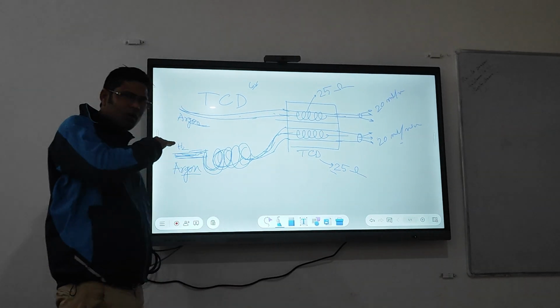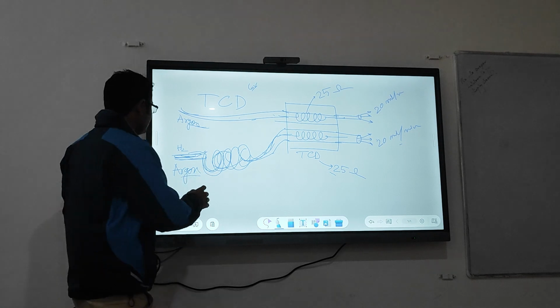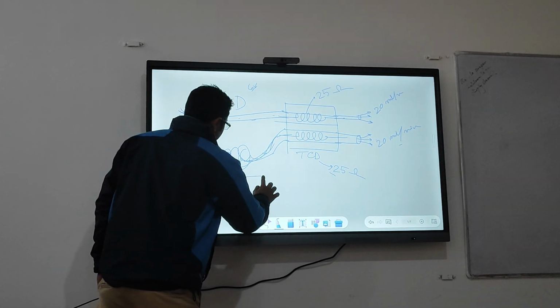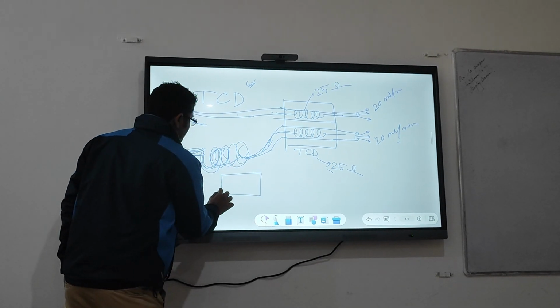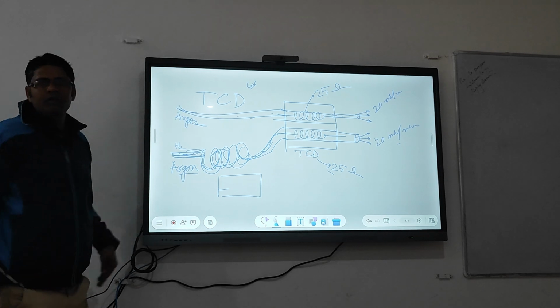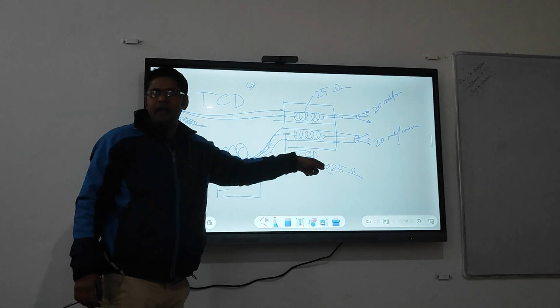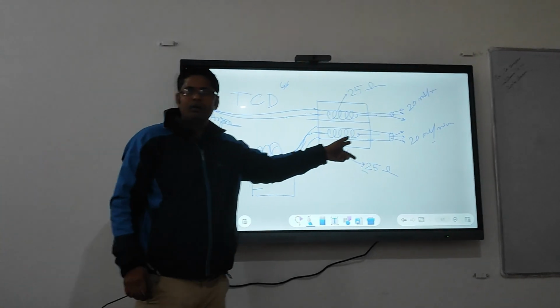So the zero difference value, you can make that graphic in your computer. You can see the representation of zero difference value is a straight baseline, because that value is not changing. Right? We are not injecting anything. Only argon is going through the column.